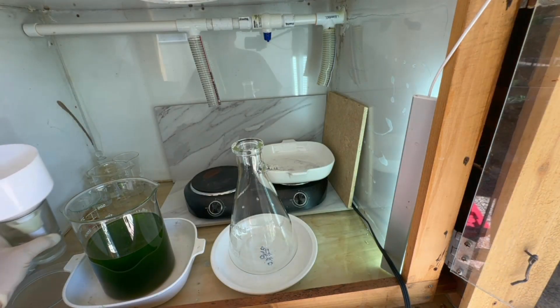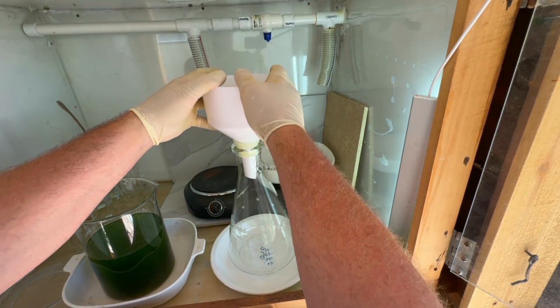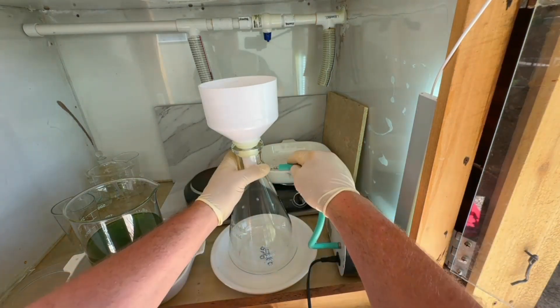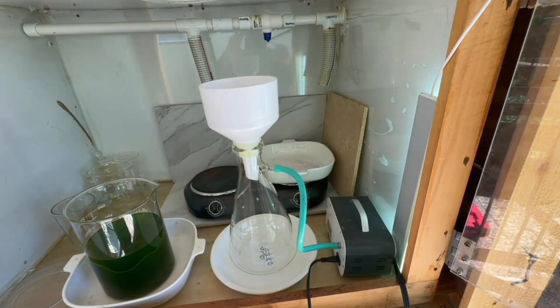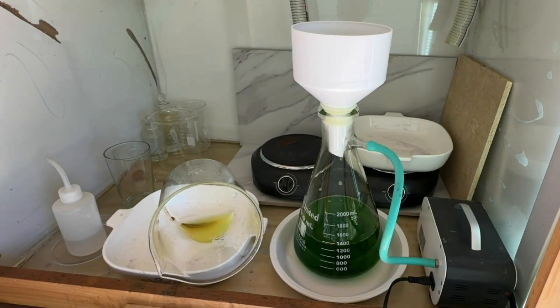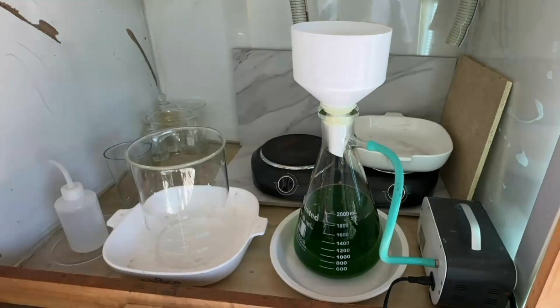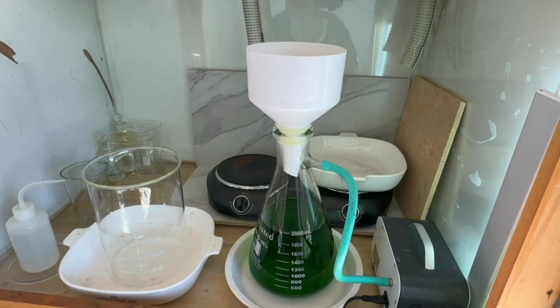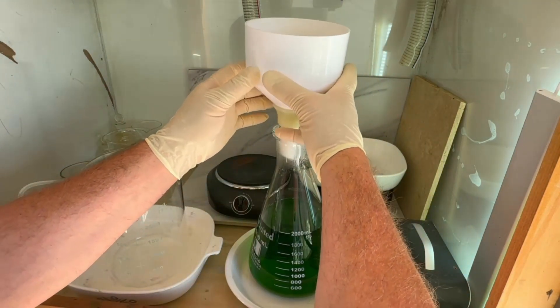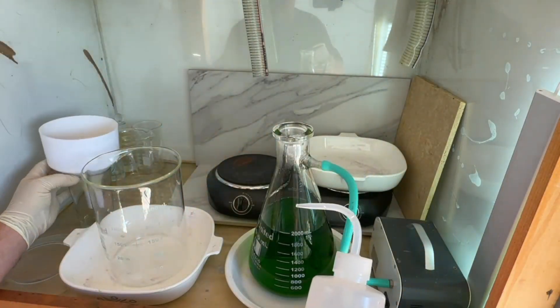We're going to set up and filter our gold-bearing solution — it's a bit dirty, obviously, given the green color. Coming through the filter, the solution is looking a lot clearer. I think we're going to be good to drop here without having to filter again. Now we're all filtered; we'll get the solution back into the clean beaker and get ready to do our first gold recovery.